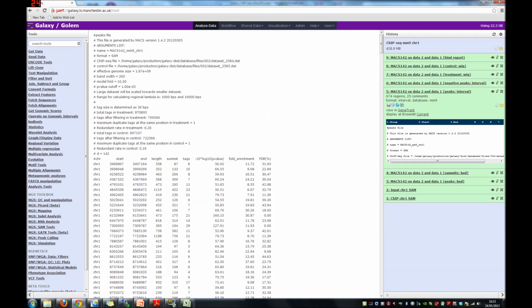And also it shows the value of D it predicted, which again is the distance between the bimodal peaks of forward and reverse reads. It's slightly more complicated than how I described it, but that will do for the moment.